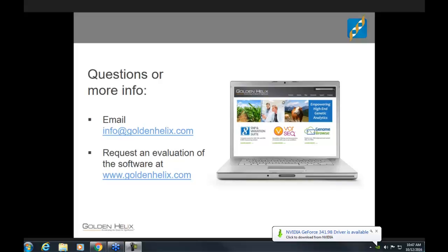Yes, and so that's a very good point. We can't provide you with pre-baked reference samples. Even if we wanted to, you really do need to have those that are being run using the exact same target capture kit and preferably the same sequencer. We have tested this across multiple runs, and we think the run level effect is handled by the normalization, but certainly as soon as you do things like change the target capture and you add an exon or delete an exon or add genes or delete genes or are not comparing the same set of targets, all bets are off in terms of being able to do this comparative-based approach.